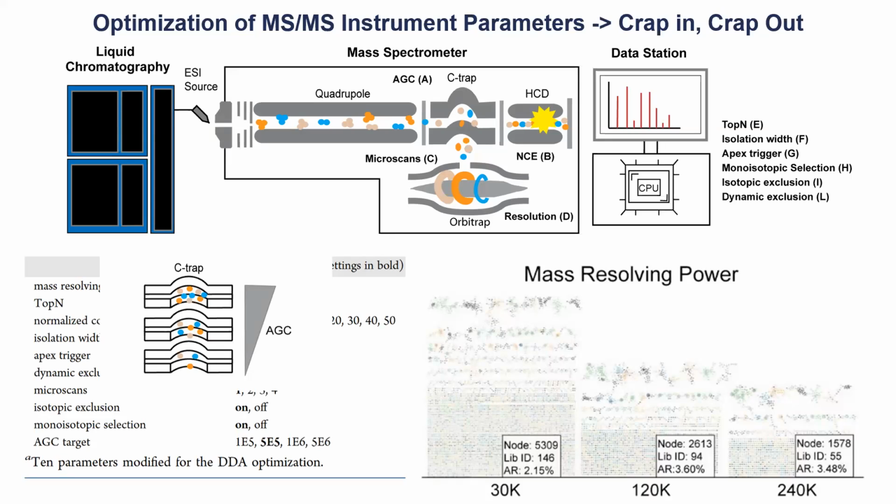And here we have a very simple visualization in the form of these three molecular networks that we will learn more about tomorrow on Wednesday. You can see that if we have the highest resolution here on the right, we get the lowest coverage. Now perhaps for some molecular formula annotations, the high resolution really helps. So separating almost isobaric species, it helps.